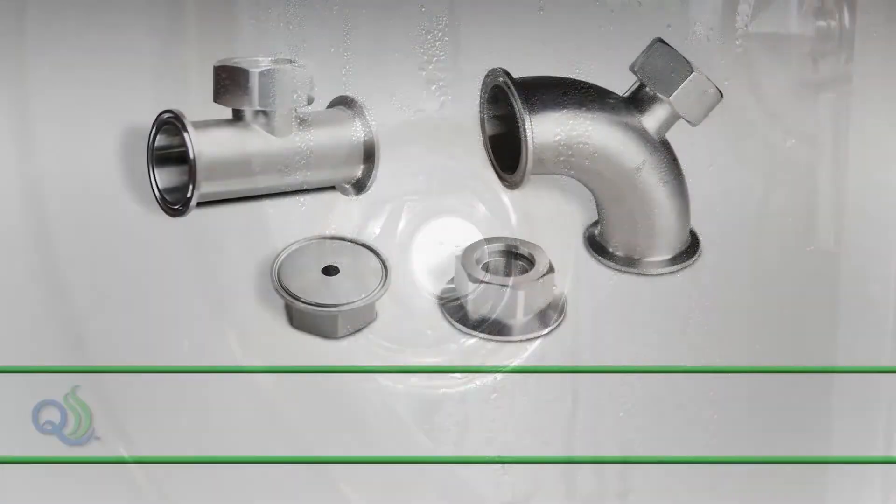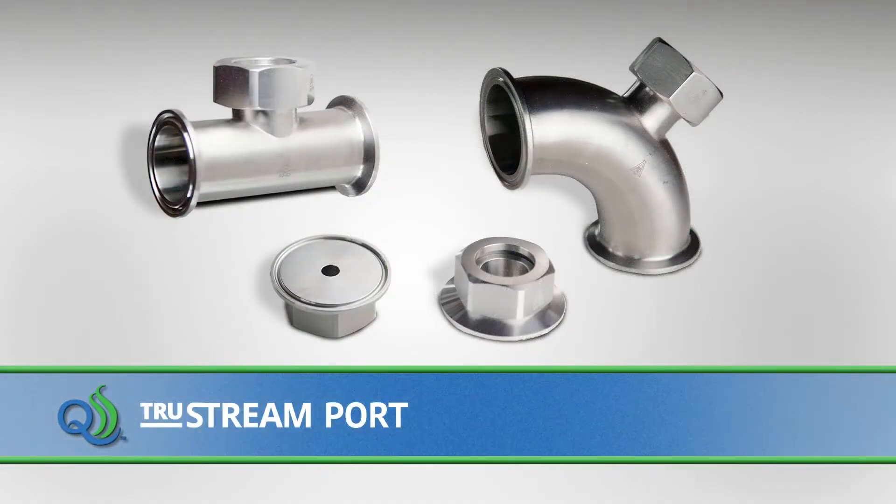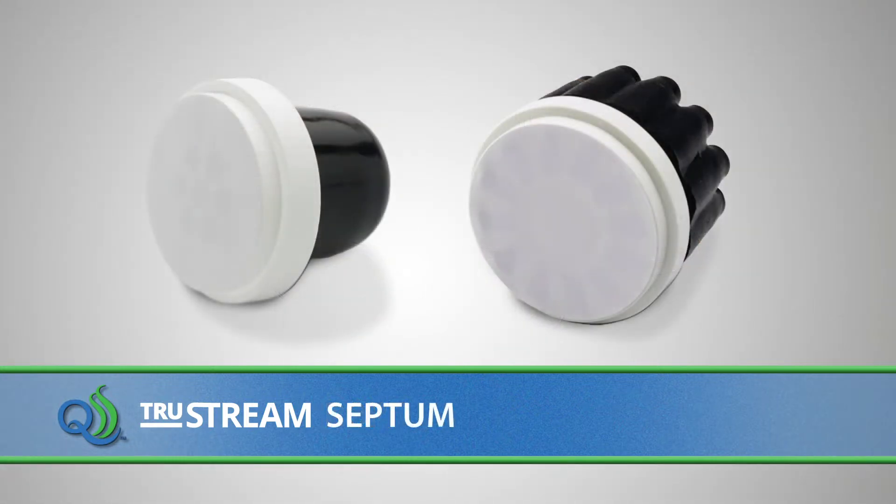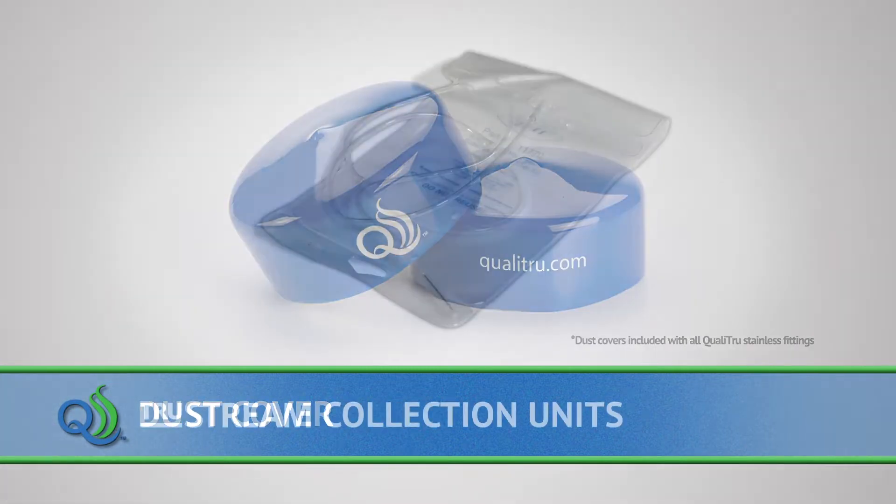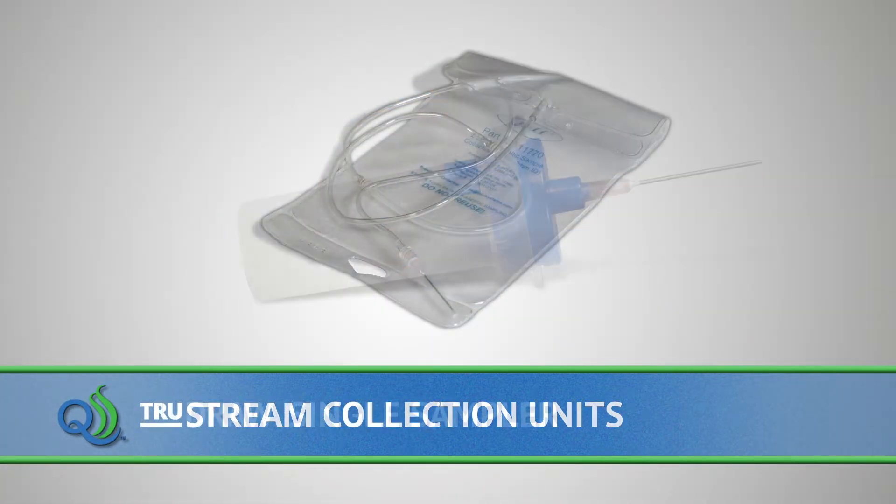The items needed for this process include a TrueStream 7 or TrueStream 12 stainless steel sanitary sampling port, a 7 or 12 channel QualiTrue sterile septum, a blue dust cover, and a TrueStream collection unit or TrueDraw single sampler.